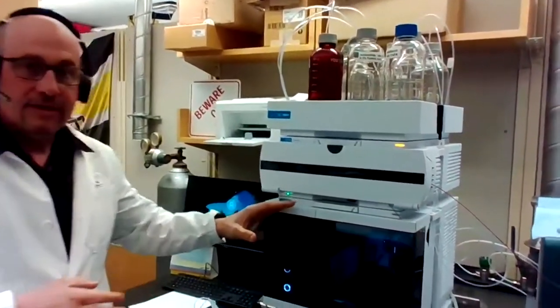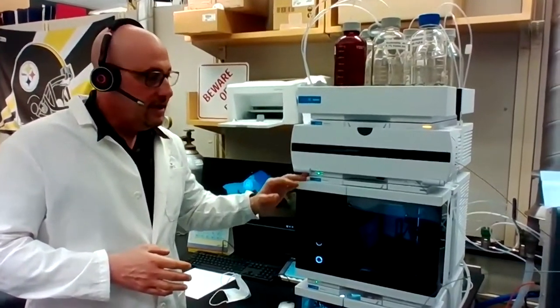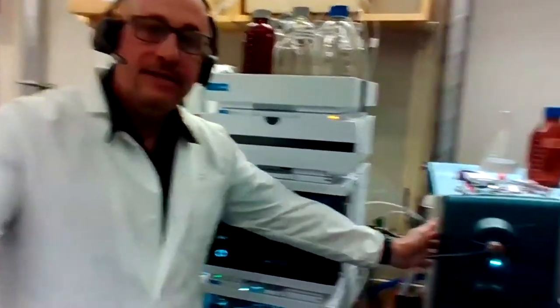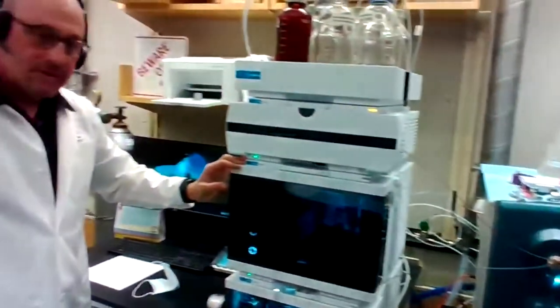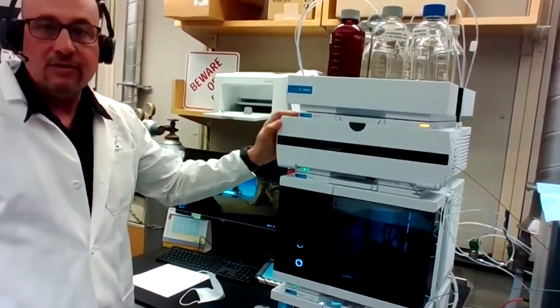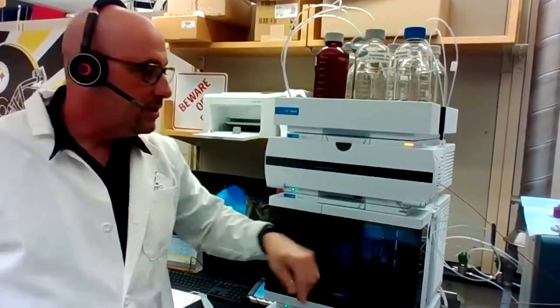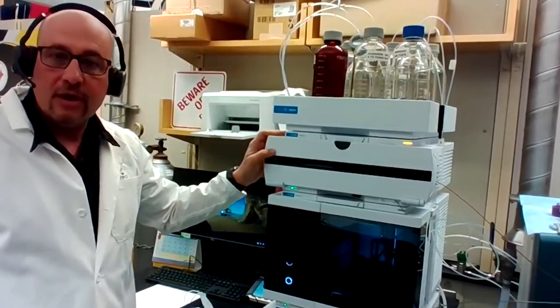What we have here is an HPLC mass spectrometer. This part here is the HPLC, and over here is the mass spectrometer. The role of the HPLC in this process is two things: one is to deliver solvents and compounds to the mass spectrometer, and also, using a column in the HPLC, we are able to separate compounds.